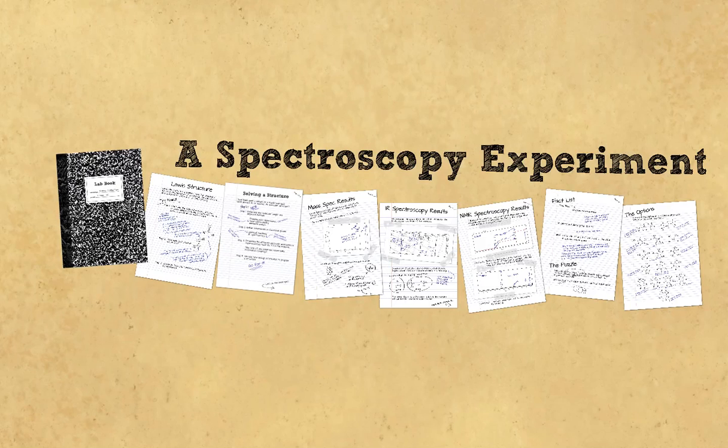and that's what we're going to be learning about throughout this course, how to use those details, how to use the exact chemical shifts in carbon 13 NMR and the approximate chemical shifts in proton NMR to determine what kind of groups they are, to use connectivity information, which will be revealed to you in the peaks being split in proton NMR. Those were nice singlets we saw there, and you'll see in paraxylene, no protons were adjacent to each other. Those protons were on carbons where the adjacent carbon had no protons. So I chose that so that there would just be nice, sharp, single peaks for you in the proton NMR.